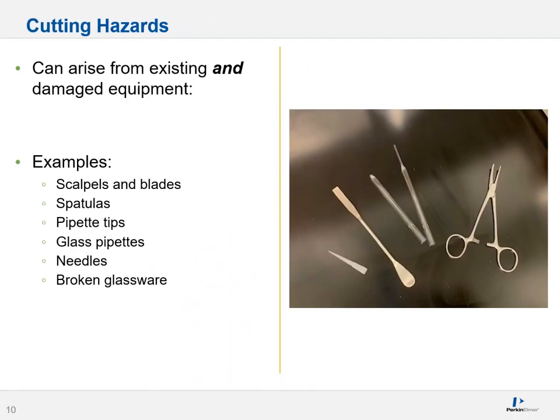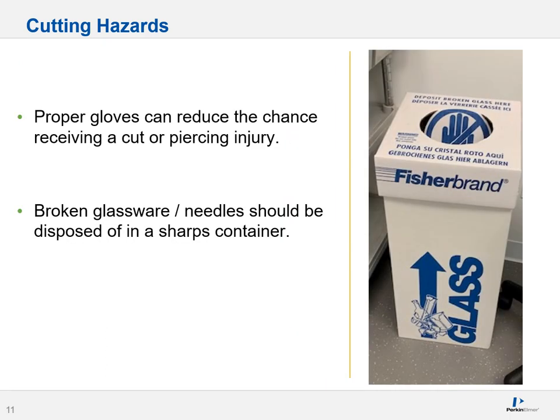Cutting hazards are also quite frequently found in labs and can arise from existing and sometimes damaged equipment. For instance, scalpels, blades, spatulas, pipette tips, glass pipettes, needles, and broken glassware are all examples of potential cutting hazards — also sometimes called piercing hazards. Using appropriate gloves can significantly reduce the chance of receiving a cut or piercing injury. Please keep in mind that broken glassware, needles, and equivalent items should be disposed of in an appropriate sharps container. Please don't throw them into regular trash.